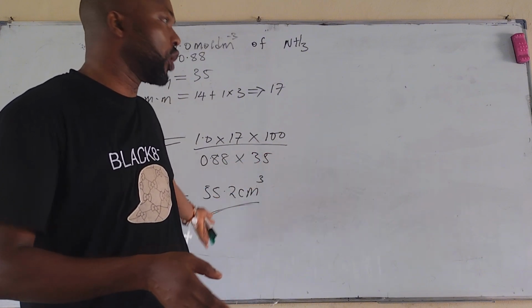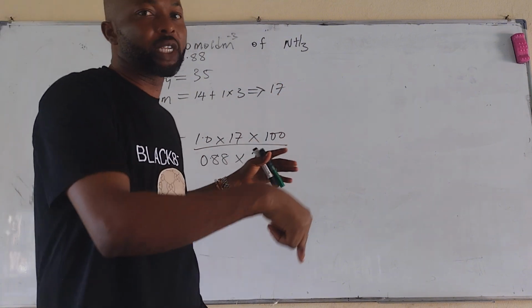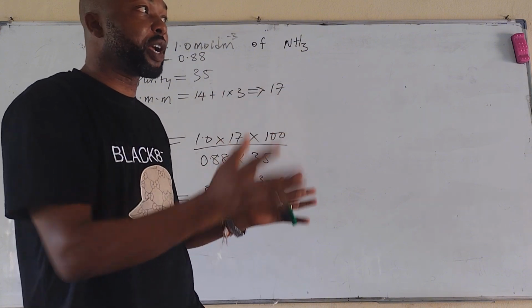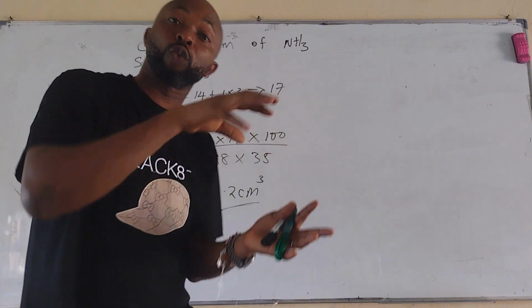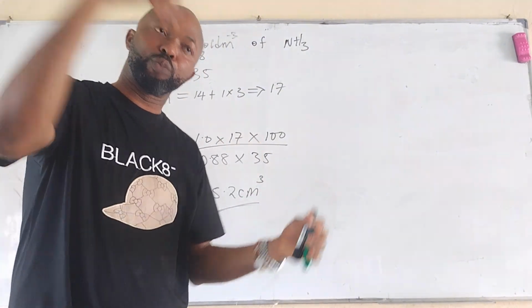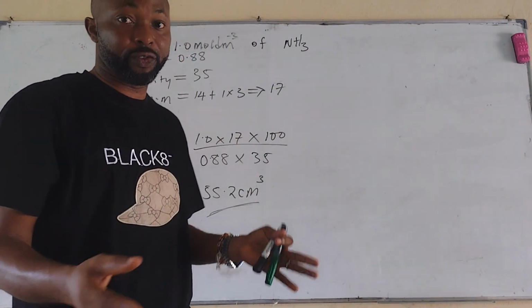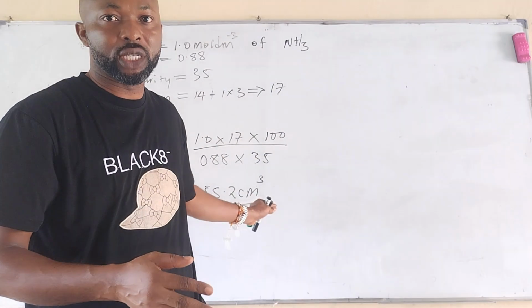And when that is done, don't forget, we always put acid into water and not water into acid. When you're done preparing, you measure the required amount of acid and pour it into the required volume of water. Do not make the mistake of pouring water into the acid. It's going to splash on your face. So far, we've been able to determine that this is for solutions.